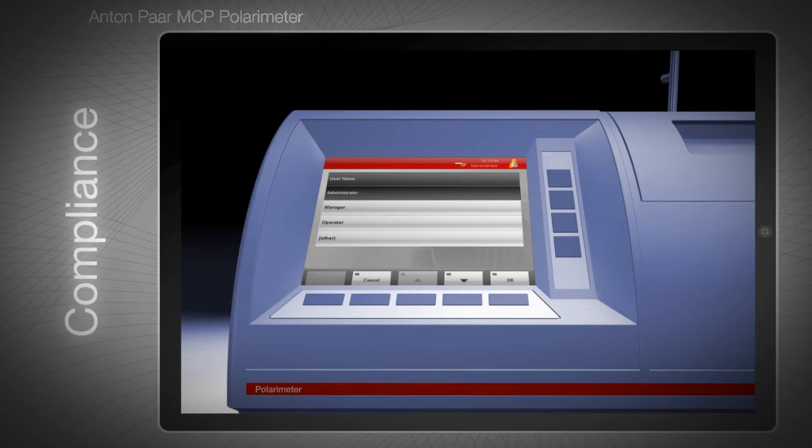Access to the MCP polarimeter is protected by usernames and passwords. Users have three different levels: operator, manager, and administrator. These user levels govern the rights to do measurements, make changes to predefined methods, carry out adjustments, and change security settings, for example.